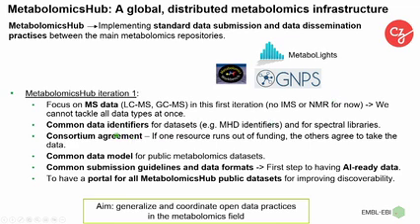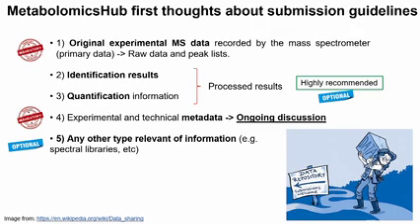The idea is that we have common data identifiers for data sets. There will be a consortium agreement. That means that if a resource runs out of funding, the others will agree to take the data, so the data is not lost for the community. There is a common data model, common submission guidelines and formats, and again, there will be an open portal for the community.